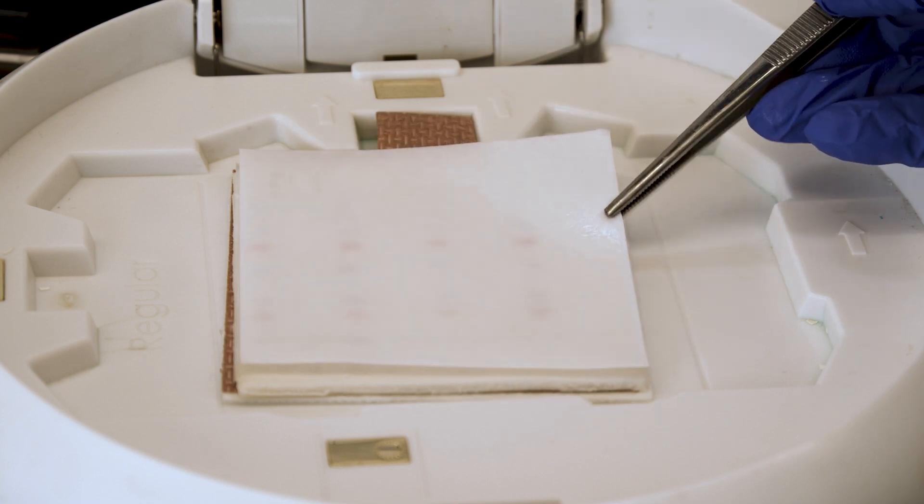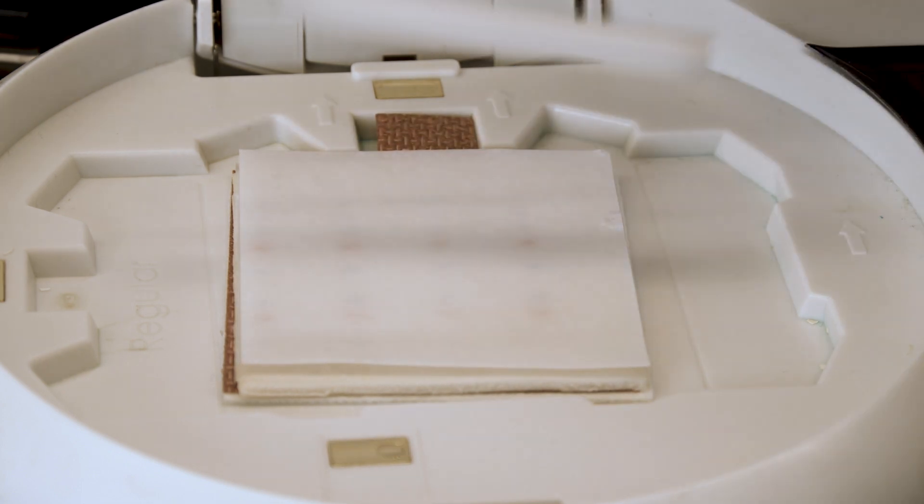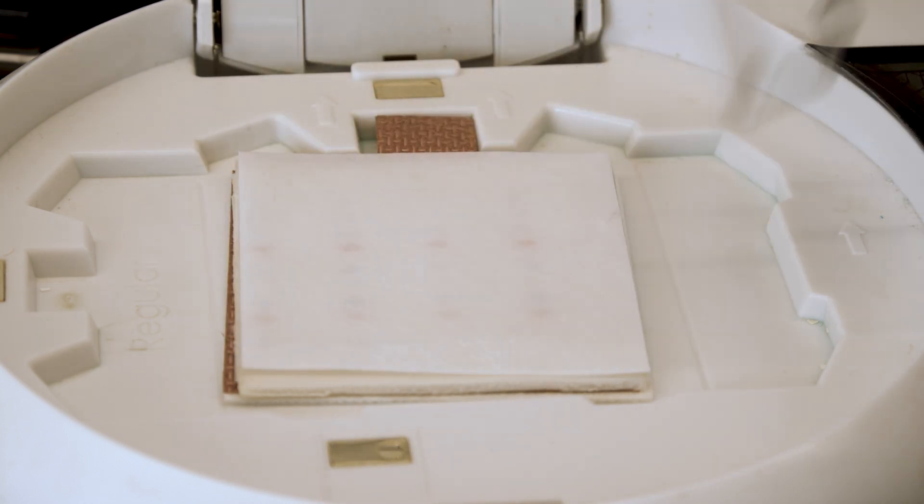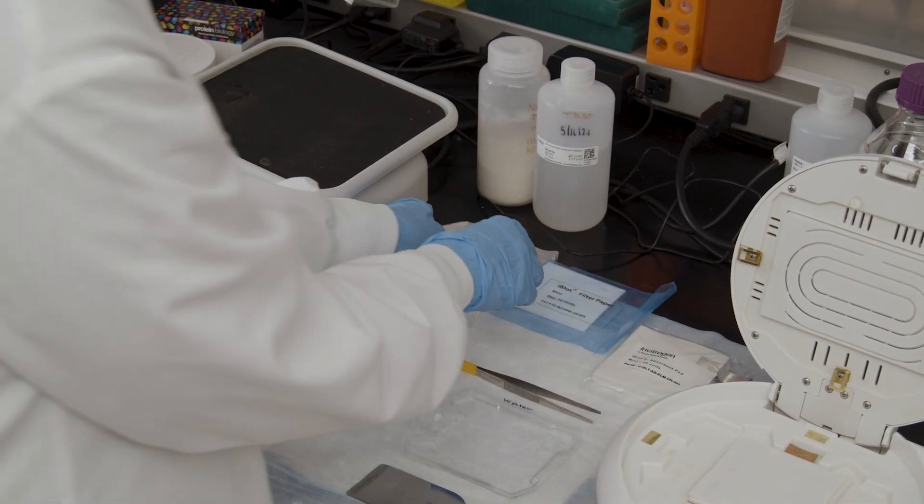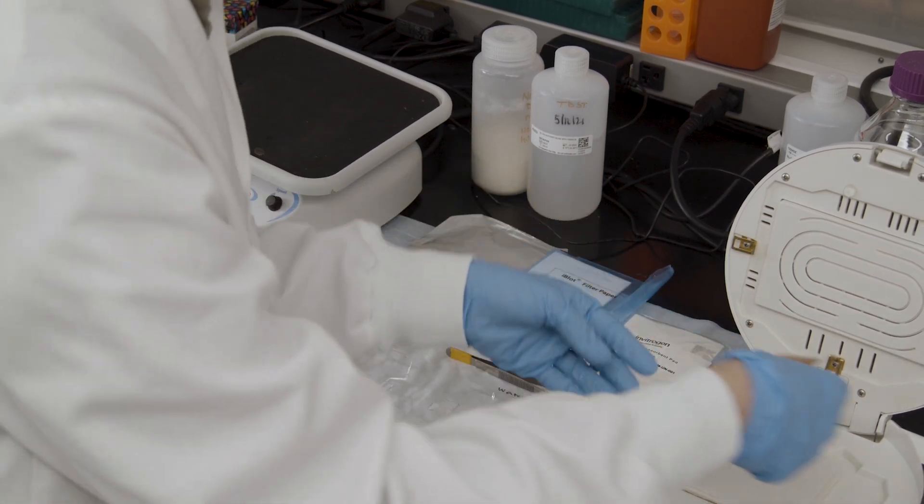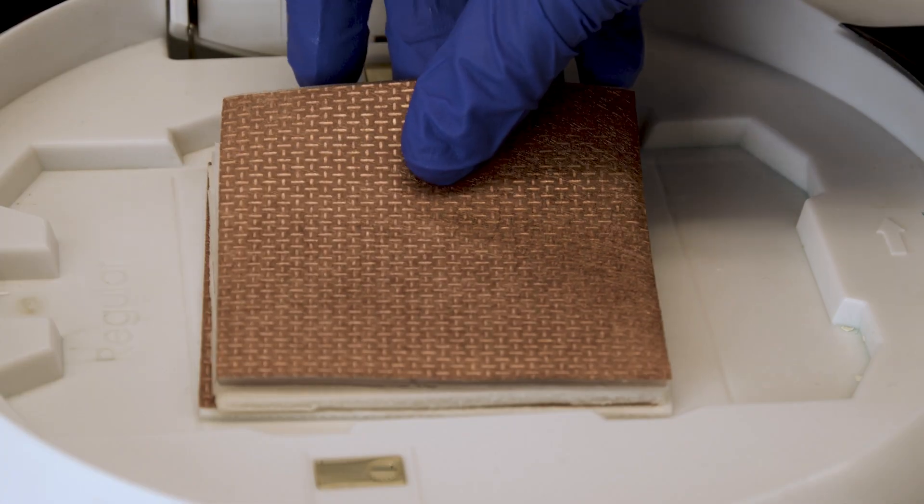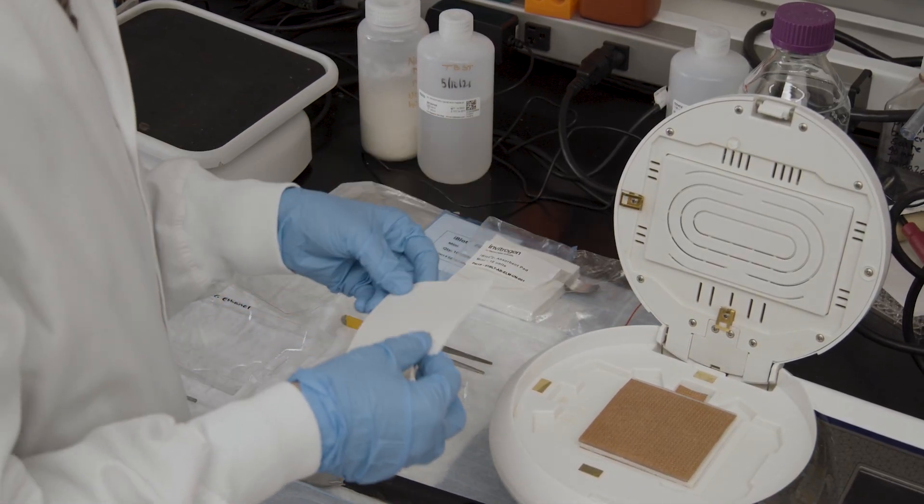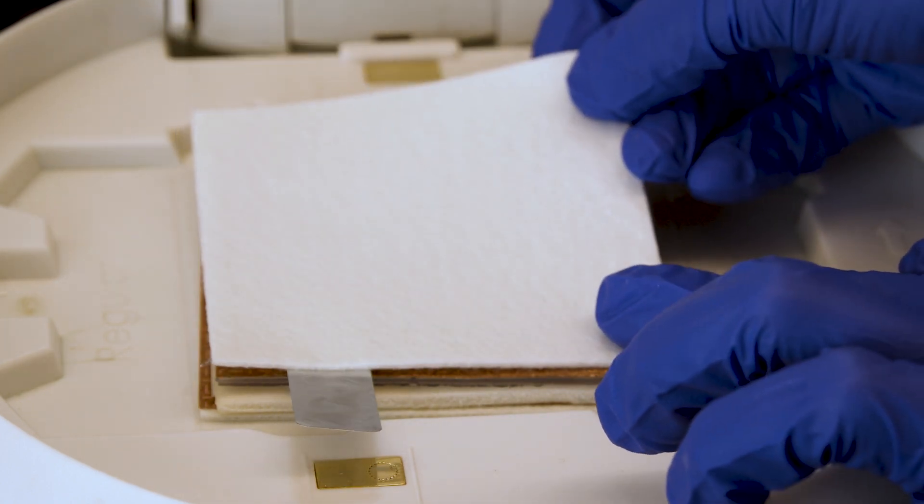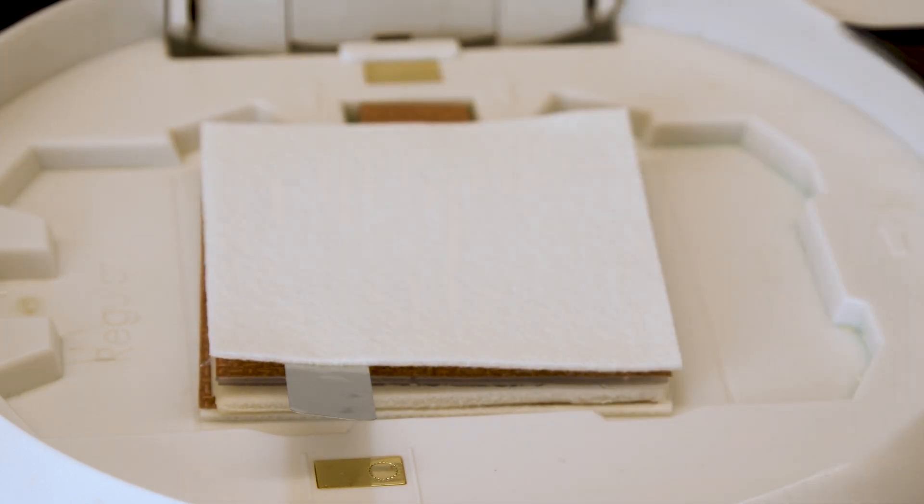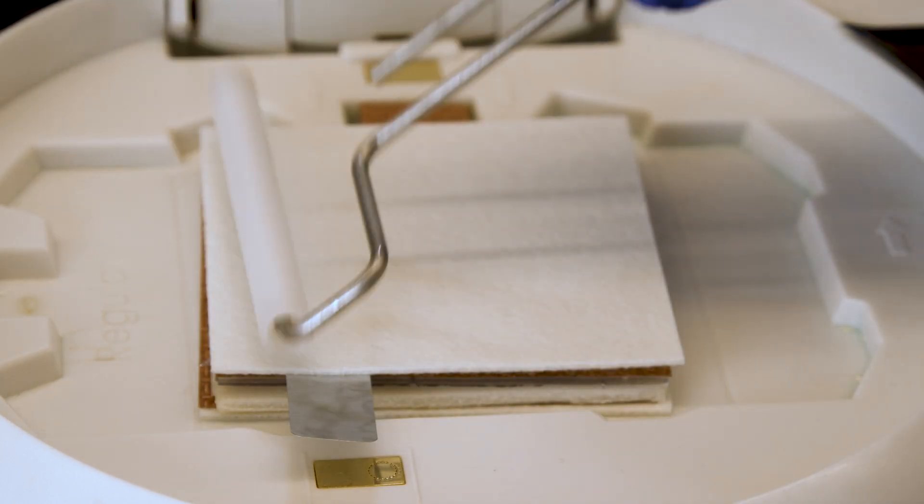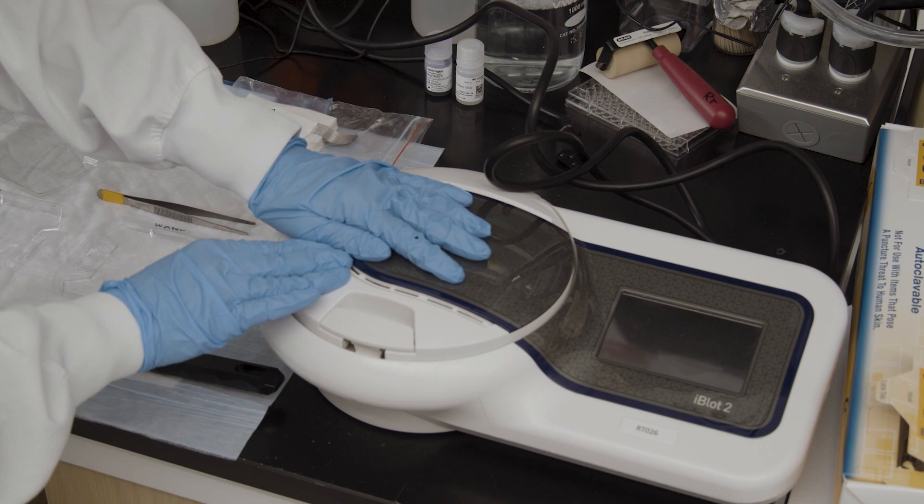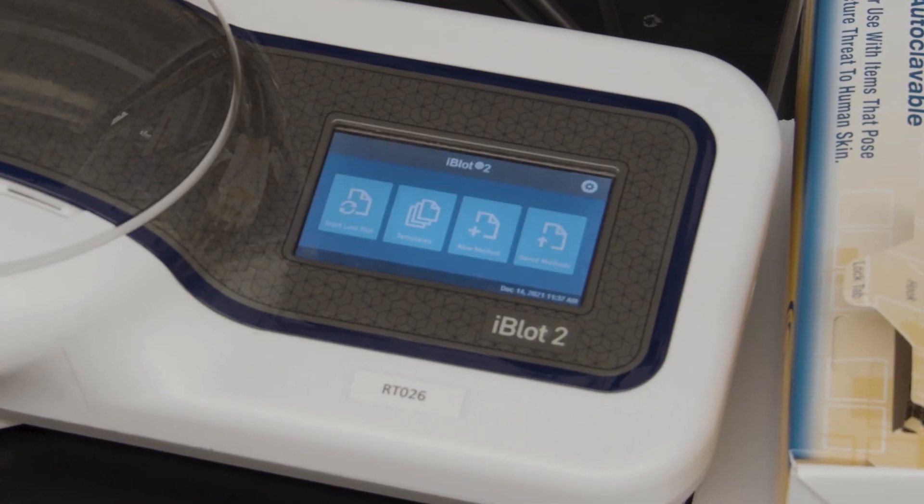Place the top stack consisting of the cathode stack, copper cathode, and an absorbent pad on the filter paper. Use a roller to gently remove any air bubbles. Cover the transfer apparatus and select and run the desired program.